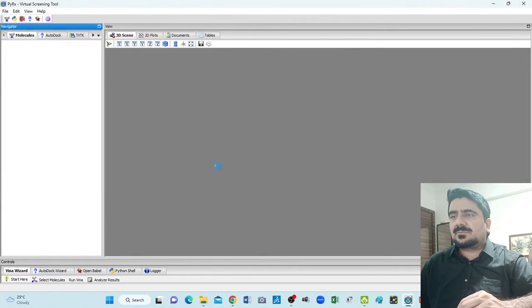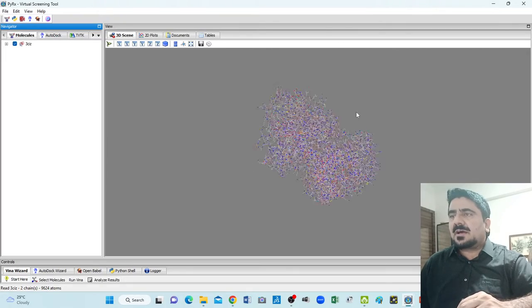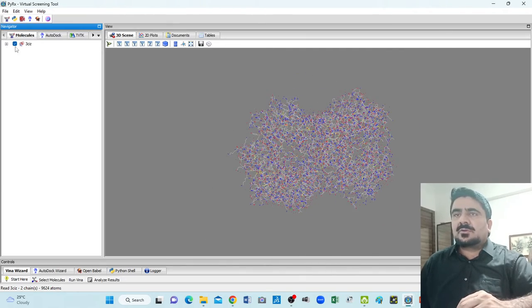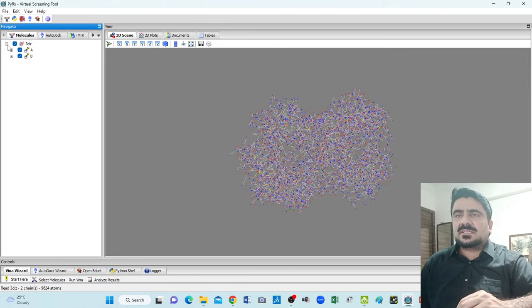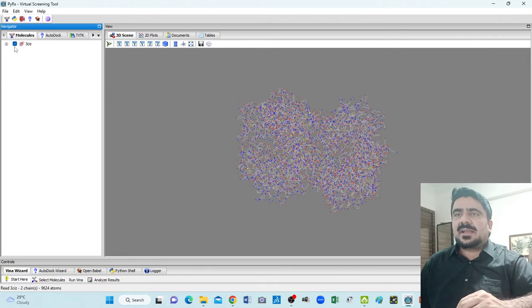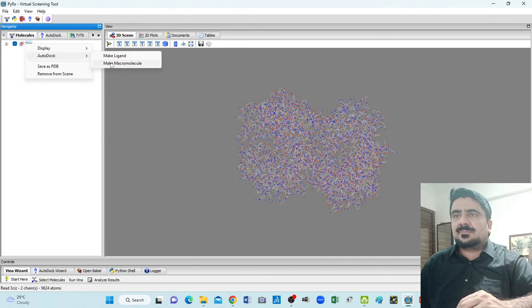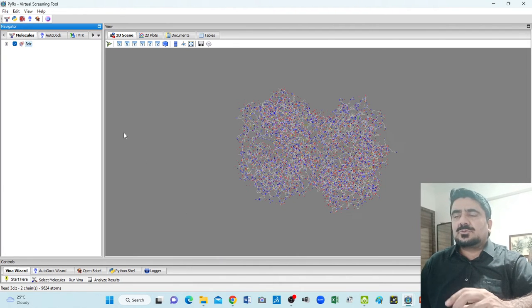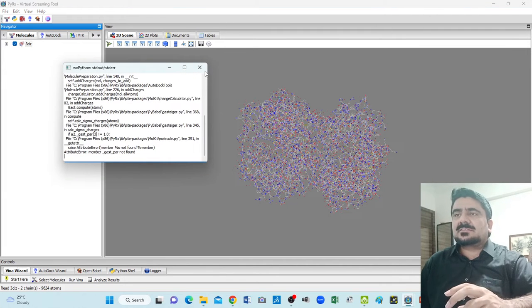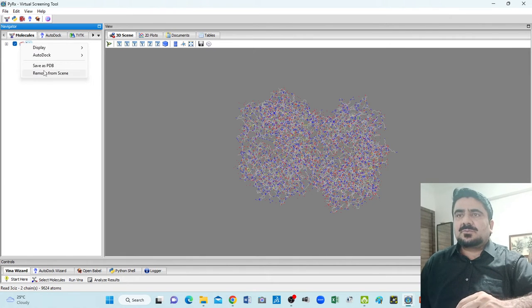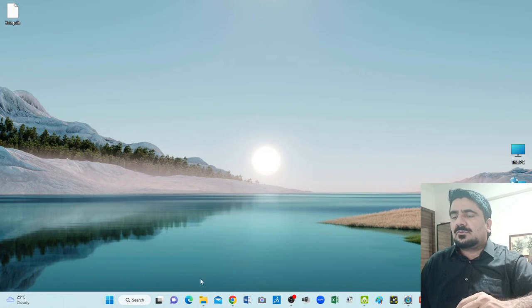Here is our file 3CIZ — open it. It will appear on the PyRx software window. You can easily see it. Now check how many chains it has — two chains. If you want to do docking on this PDB file, right-click, go to AutoDock, and select Make Macromolecule. A screen pops out — click OK. When you do this, the PDB file is not changed into PDBQT. So what is the solution? First remove it from the scene and close PyRx.